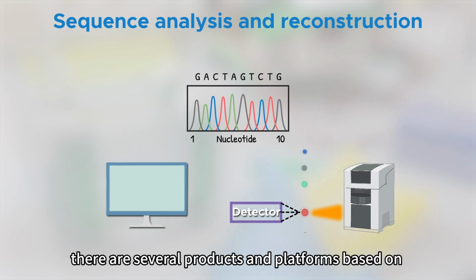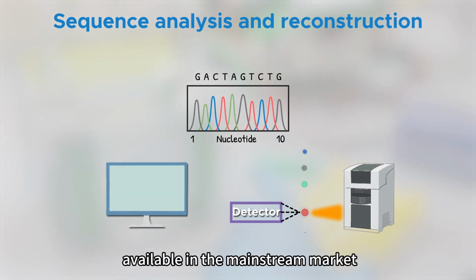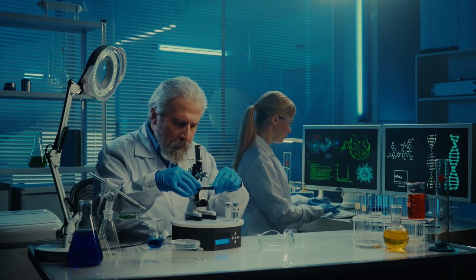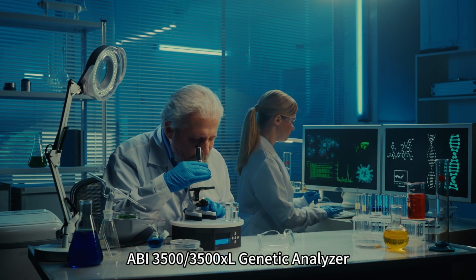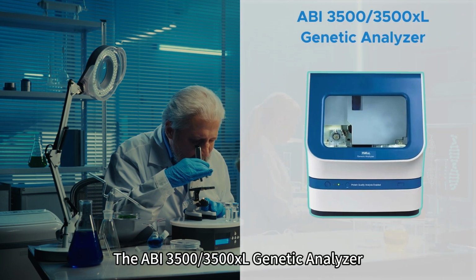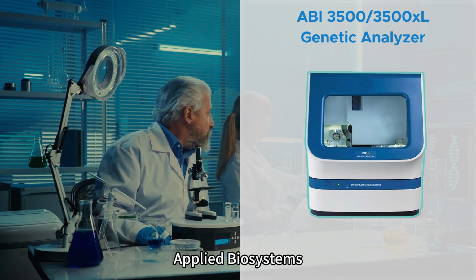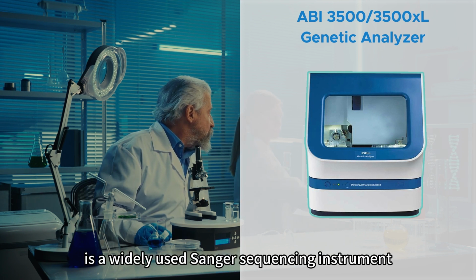Currently, there are several products and platforms based on Sanger sequencing technology available in the mainstream market. Here are some of the key Sanger sequencing products and platforms. ABI 3500 or 3500XL Genetic Analyzer. The ABI 3500 or 3500XL Genetic Analyzer, introduced by the biotechnology company Applied Biosystems, is a widely used Sanger sequencing instrument.